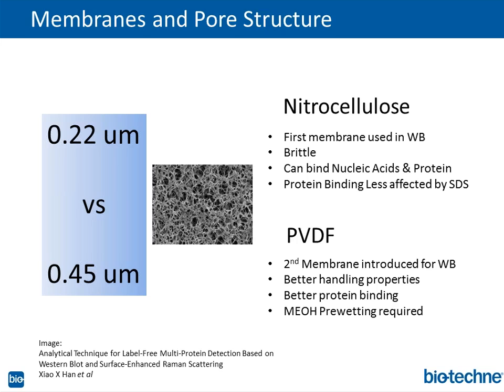Now its binding mechanism, of course, I usually poll my audience, how many people here use PVDF? And then I ask people, well, what's the first solution to put PVDF into? And of course, people will say 100% methanol. And the reason is because you're dealing with a phobic nonpolar substrate. You've got to get that thing to be philic, polar.